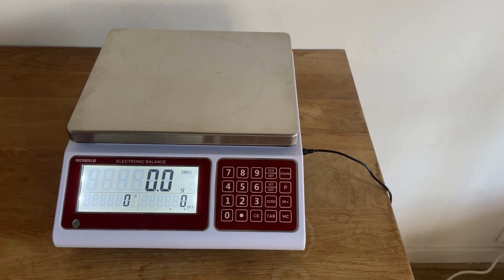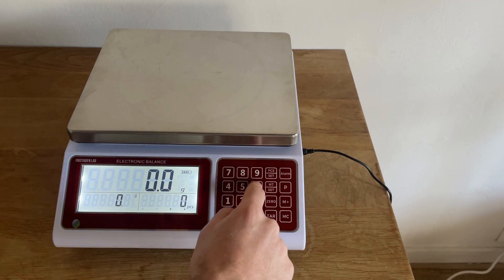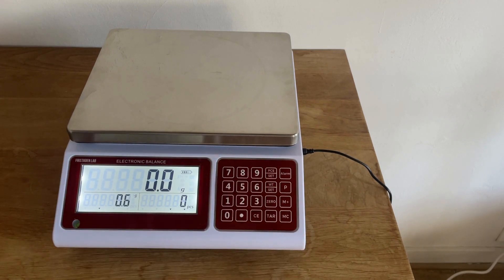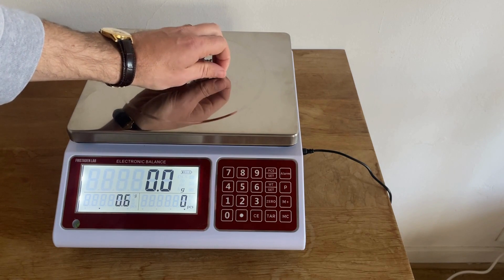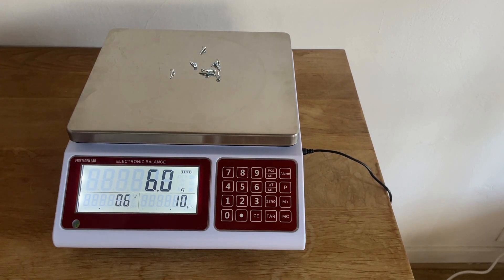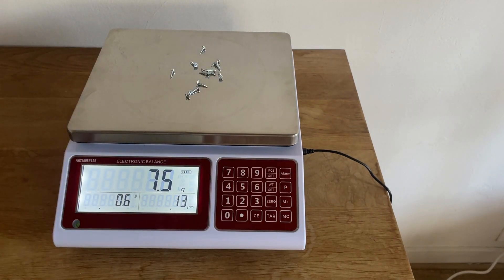You can also count pieces if you know the exact weight of the piece. Enter the weight — in this case around 0.6 grams — and press weight set. Place your ten units on the scale and it counts them. You can add more and it continues counting. This method is slightly less accurate than measuring yourself, but can be quicker if you already know the piece weight.